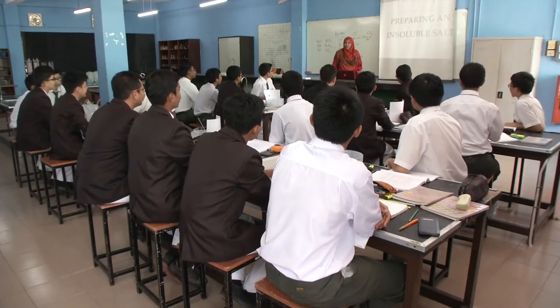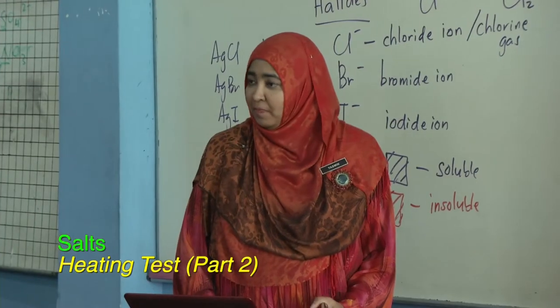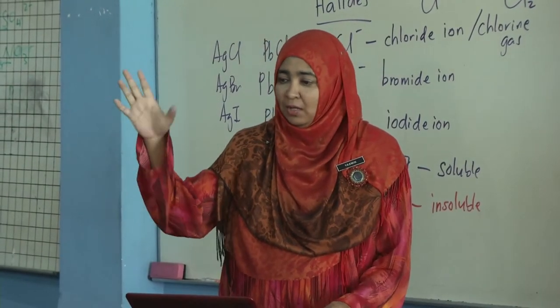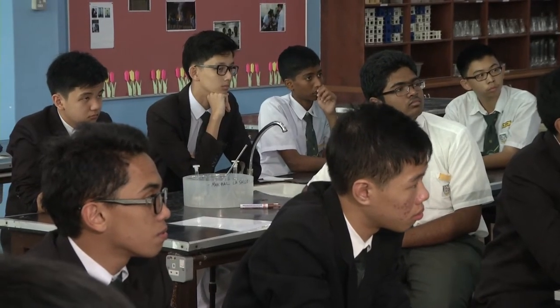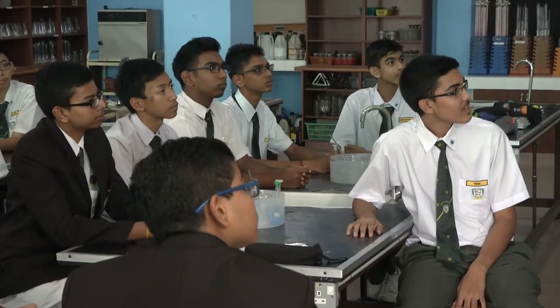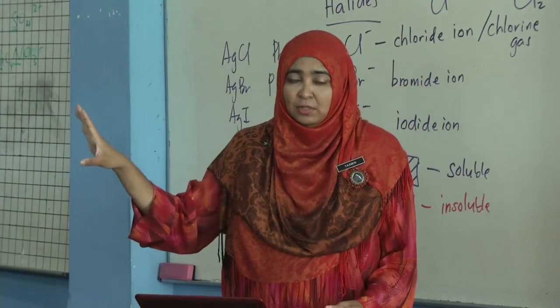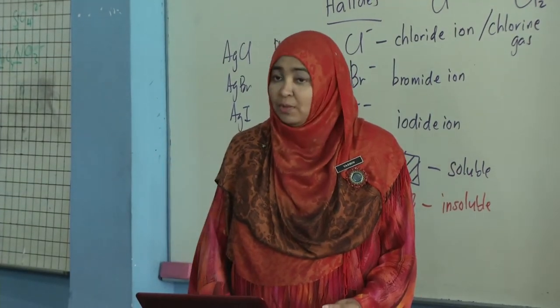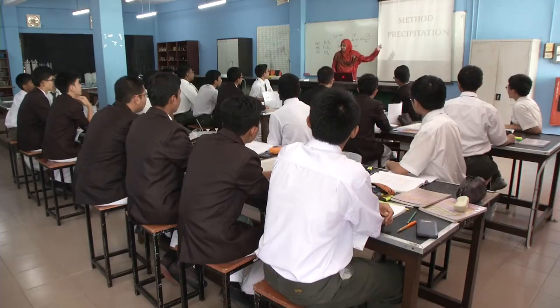Okay, now that you have identified the insoluble salts, we are now to prepare the insoluble salt. If you can see on your table, in the basin, the lab assistant has already prepared two solutions in a volumetric flask for you to carry out the experiments later. But before you can carry out the experiment, you need to know the method. What is the method?